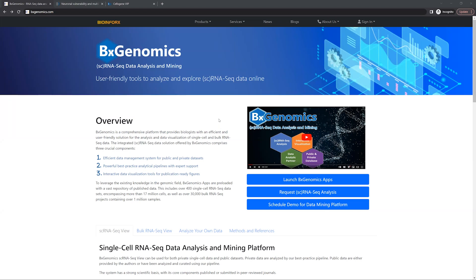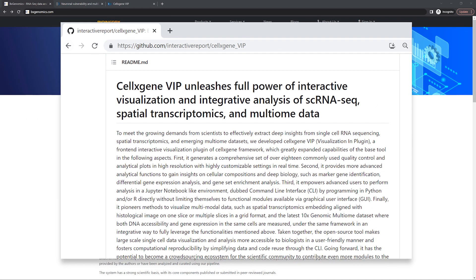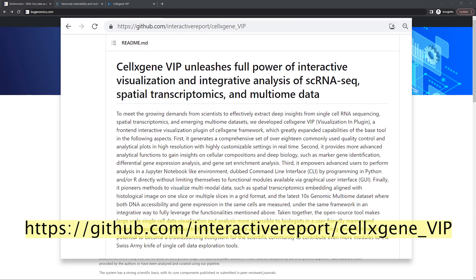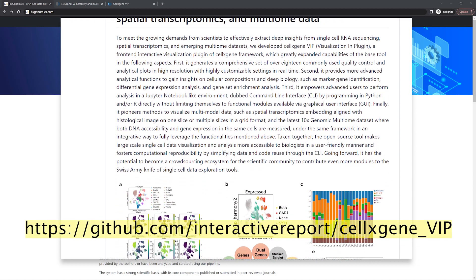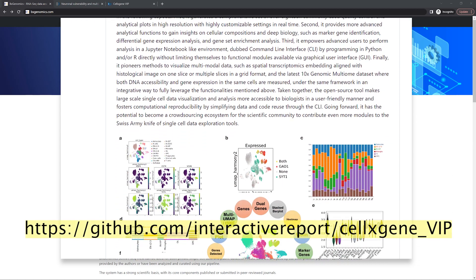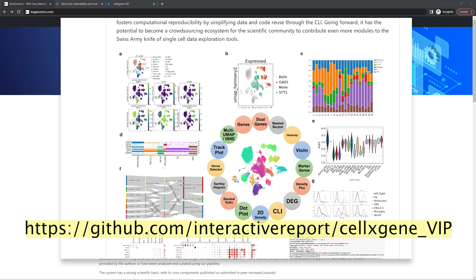BxGenomics offers an easy-to-use solution for analyzing and visualizing both single-cell and bulk RNA-seq data. Today, we'll be introducing Cell-by-Gene VIP, a key component of BxGenomics for interactively visualizing single-cell data.